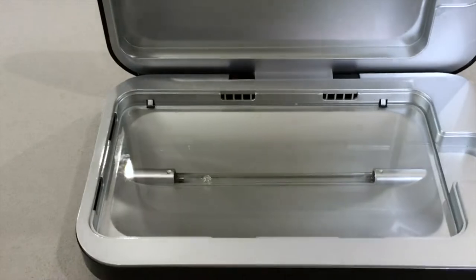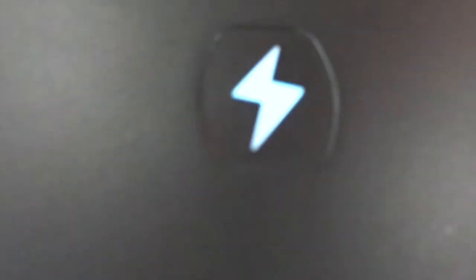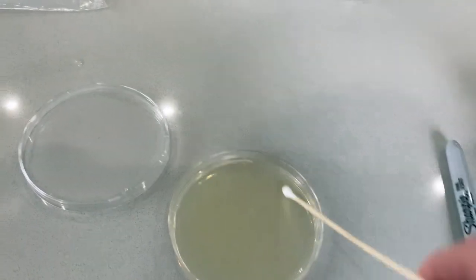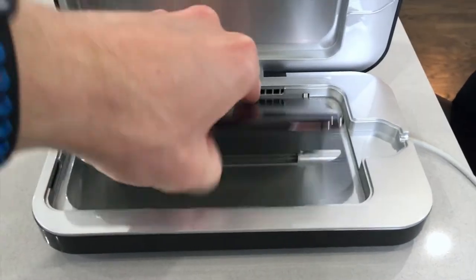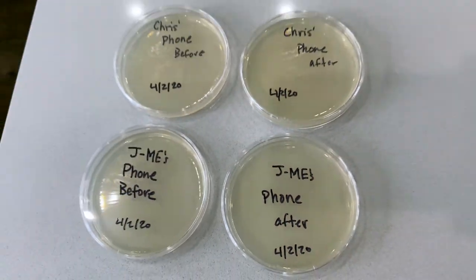After that we will do my phone. Swabbed it before, here I am placing it in. Nice good shot of those invisible little bacteria — they're all in there, you can't see them yet. And pulling it out and swabbing it again. Now we have both me and my boyfriend's phones.